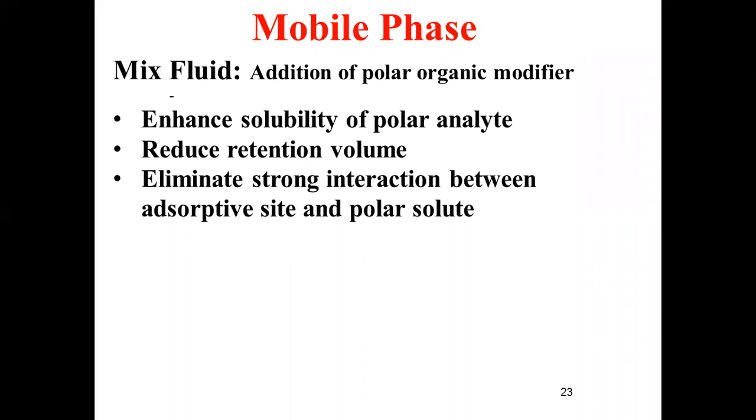Say, for example, if you mix carbon dioxide with methanol, the polarity of the supercritical fluid will be increased. Therefore, the solubility of the polar analyte in this mobile phase will be increased. Therefore, the retention of the solute in the mobile phase will become increased. And they will reduce the retention time. As a result of the reduced retention time, the separation time is going to be reduced to the maximum extent.